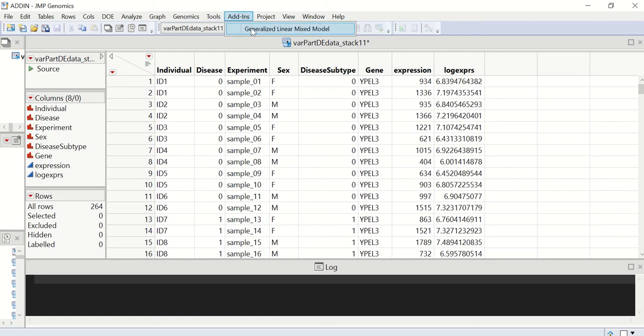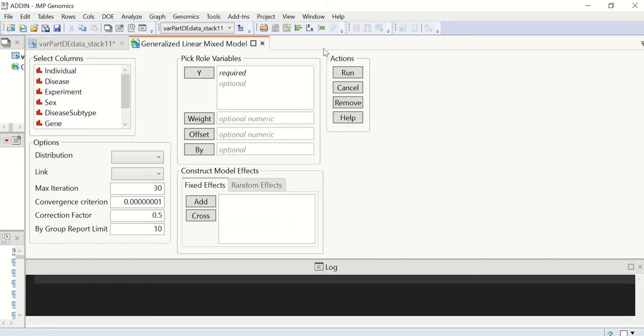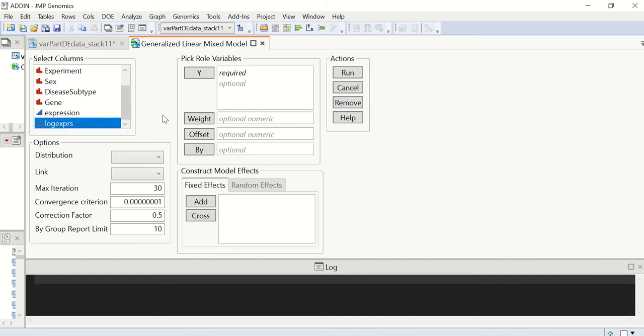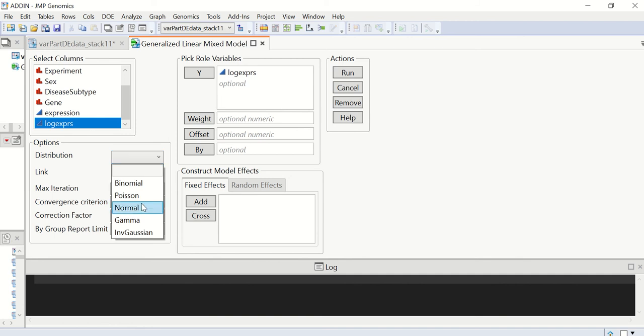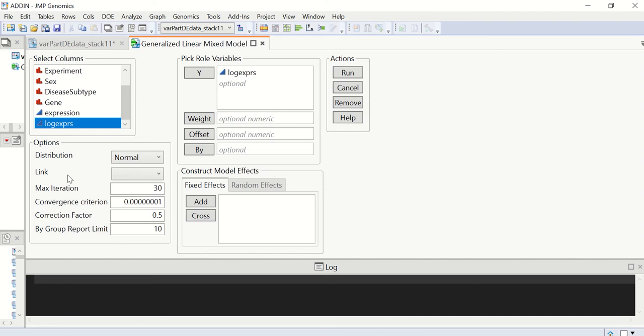Next, we go to our user's interface. We can first specify the response variable. To save time, we use the log transformed expression and normal distribution. Here, if we leave this link function box as blank, we're going to use the canonical link.